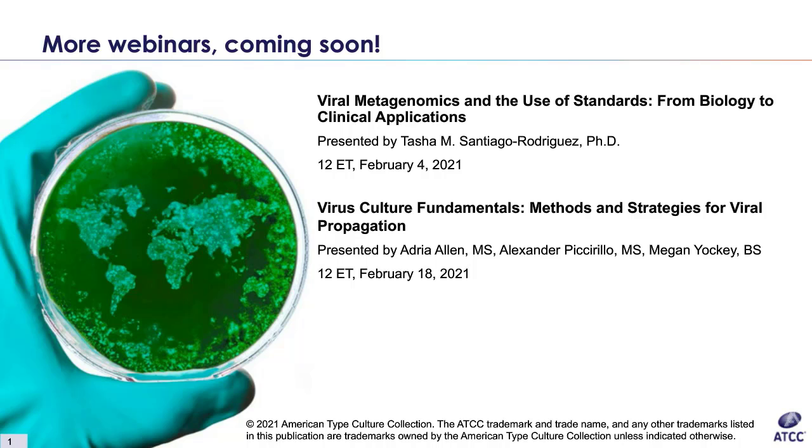All right. Here's an interesting question. Can cryovials expire? So if you mean expire in liquid nitrogen, no. As long as they're kept in liquid nitrogen, it's accepted that metabolic activities completely cease, so it's pretty much indefinite, as long as it doesn't get above negative 130 degrees Celsius or so. As long as they're in the liquid phase in liquid nitrogen tanks, they really don't expire.